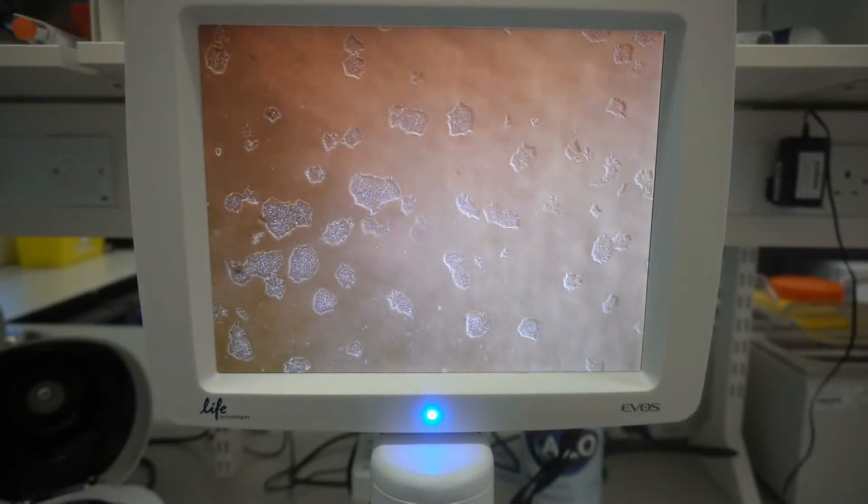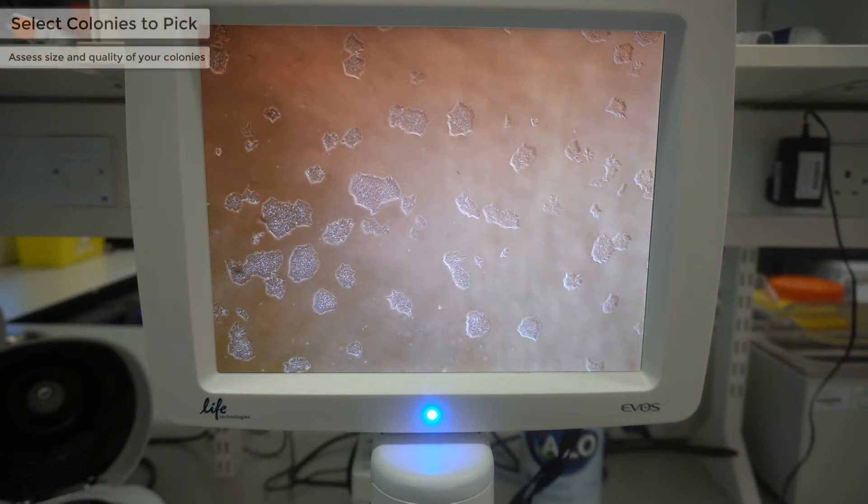This video will offer advice on how to colony pick clonal feeder-free IPS colonies after reprogramming using the Thermo Fisher Cytotune IPS2 Sendai reprogramming kit. Colony picking has been done on the bench instead of in the cell culture hood for demonstration purposes only. We recommend you do this technique inside the cell culture hood to ensure the sterility of all the cells and plates you're working with.